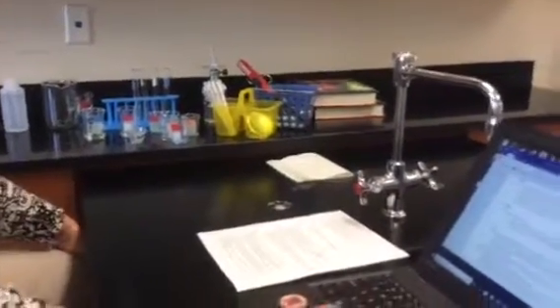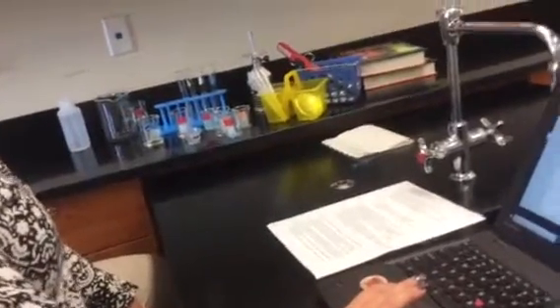Don't look at the magnesium ribbon while it's burning. I can't tell you how important that is. And then when heating test tubes, keep them slightly tilted and away from you and other people, and do not look down the test tube. All right, so in the first one, you're going to obtain a clean plate.